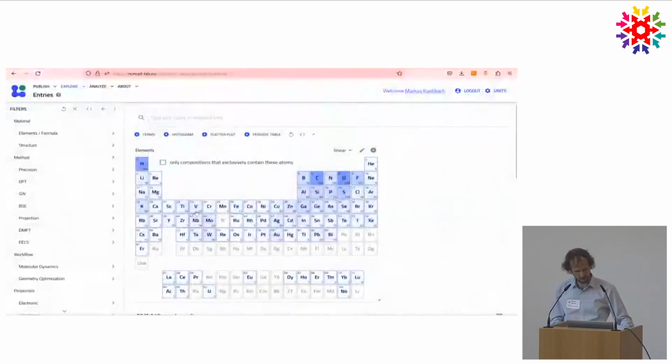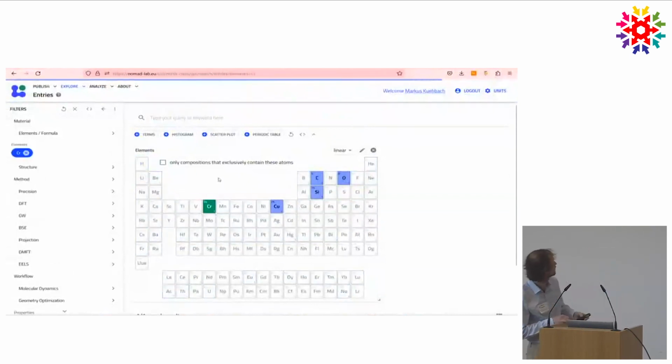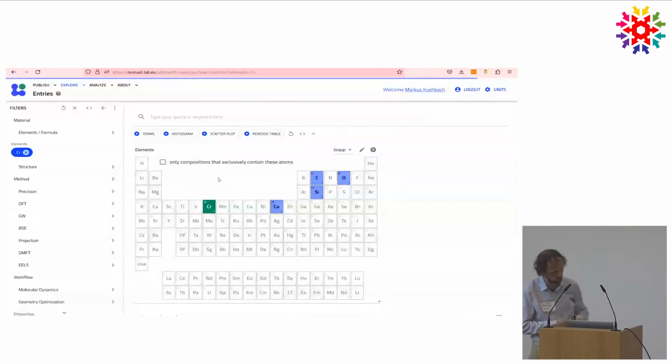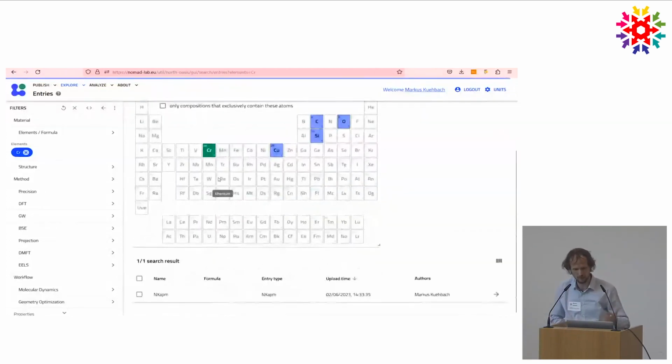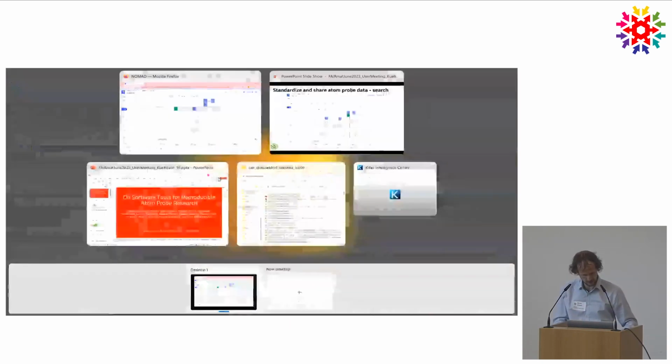But if you pick that particular one with chromium, and I know there was chromium in there, that's obviously, well, it's not cheating, but I know it's there. I could also click elsewhere, and you would find the data set on the spot. That's a little bit boring at the moment because there's only one data set, but give me a lab, and we could install that and run this, and you would see the same table filling up all the data sets that you have in the lab. Okay, I'll have to switch now back to my slide.